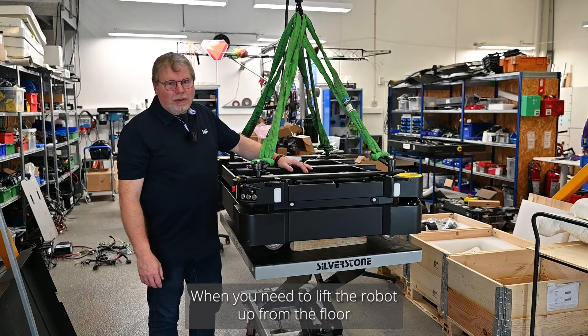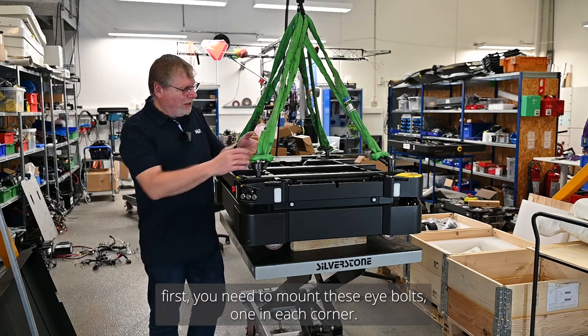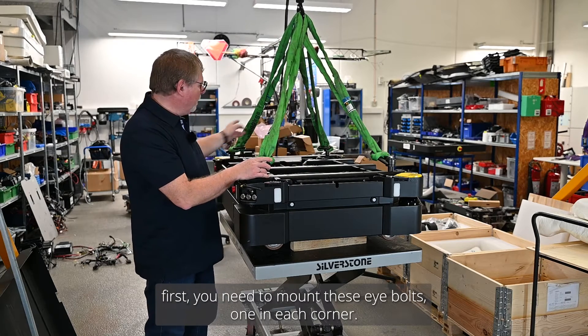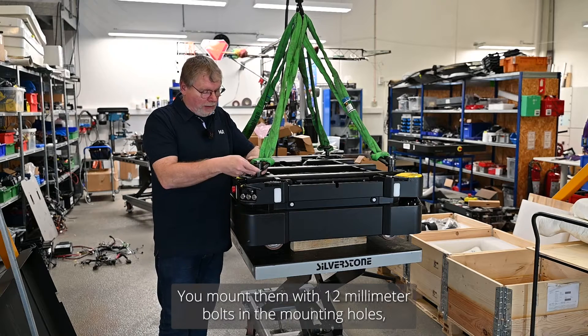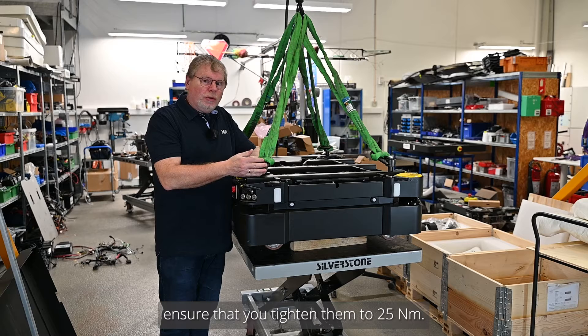When you need to lift the robot up from the floor, you first need to mount these eye bolts, one in each corner. You mount them with these 12 millimeter bolts in the mounting holes. Ensure that you tighten them to 25 Newton meters.